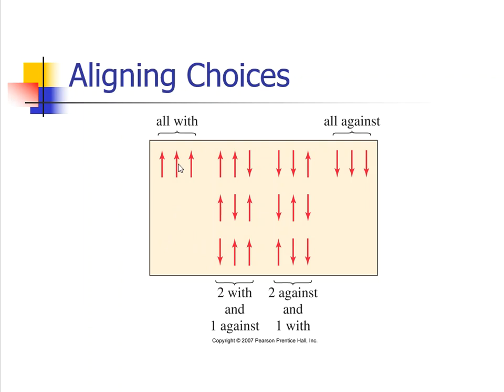You've got an option here where all three of those protons could be with, and all three of those protons could be against. And then you also have some variations where these possibilities begin to show up. These are 2 with and 1 against. So the first 2 could be with and the last one's against, right? Or the first one is with, the second one is against, and the third one is with. It's still 2 with and 1 against. Or the first one is against and the other 2 are with. It's just possibilities. They are randomized possibilities of what could show up.